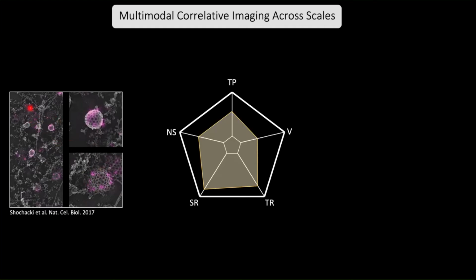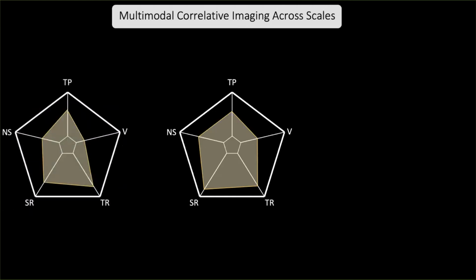However, you again only have a slightly better than two-dimensional representation because the sample has been reduced to almost two dimensions. And also because the sample is stained with a metal coating, structural information is actually less accessible, because what you are seeing is your molecule wearing a big fur coat. So there is a limit.